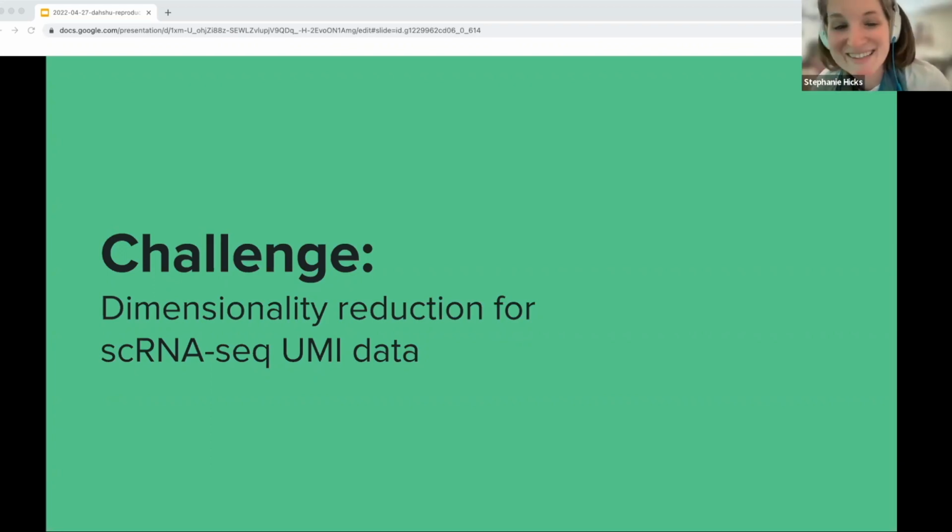That's the longest part. That is a very insightful question. This is the holdup, the slowest part of single cell analysis: calculating the principal components. There are approximate or randomized versions of PCA that you can use to speed up this process, and even that is not so fast. So if more research could be done on speeding up PCA or dimensionality reduction techniques that preserve distances between observations in a very fast way, that would be huge.